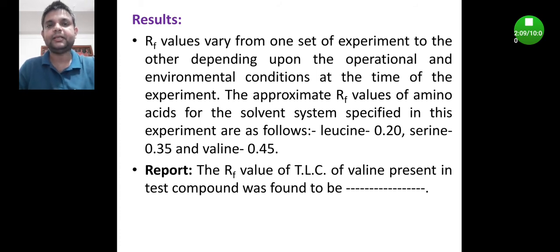We brought the plate to room temperature and measured approximately 2 centimeters from the base. This is known as the application point. From 2 centimeters, we measured 10 centimeters, which we kept for the solvent phase.